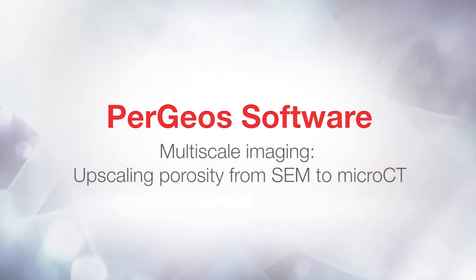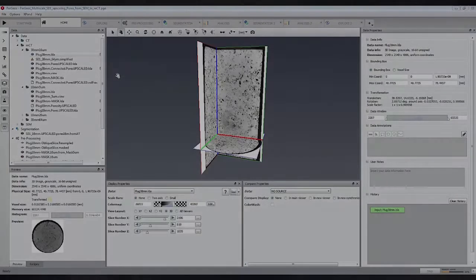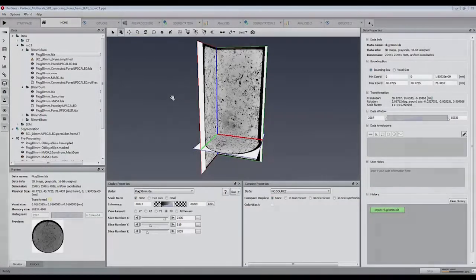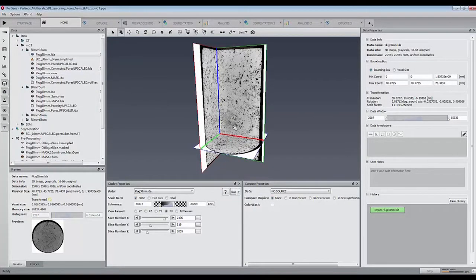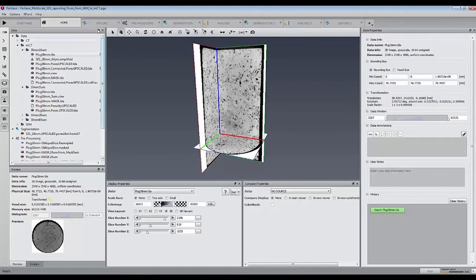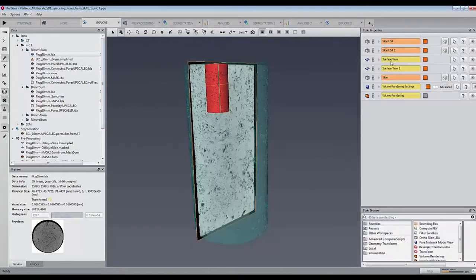This tutorial is part of a larger demonstration about how PERGEOS can perform multiscale analysis. We have scanned a carbonite sample given by the Mazdar Institute in Abu Dhabi with the Heliscan MicroCT.